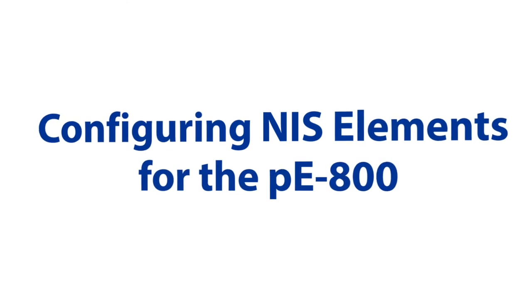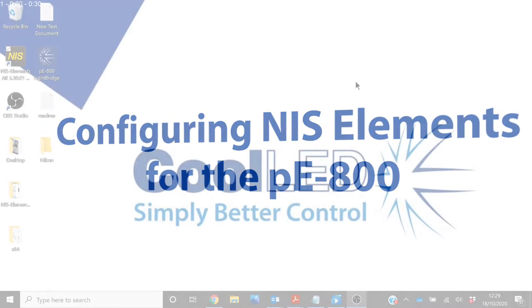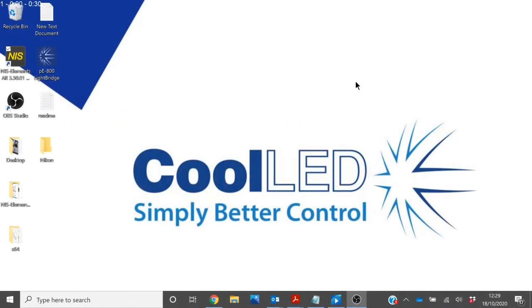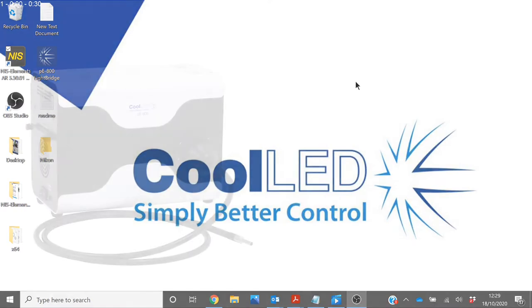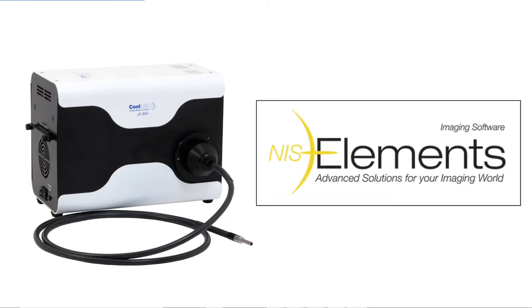Hello and welcome to this CoolED tutorial video. In this video we will be showing you how to set up and control the PE800 in Nikon's NIS Elements software using just a USB connection.